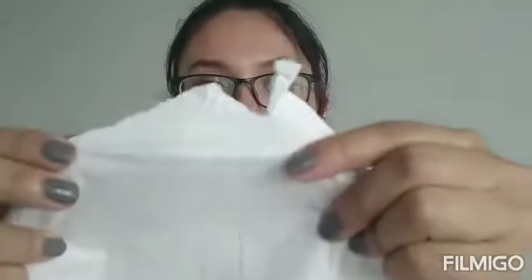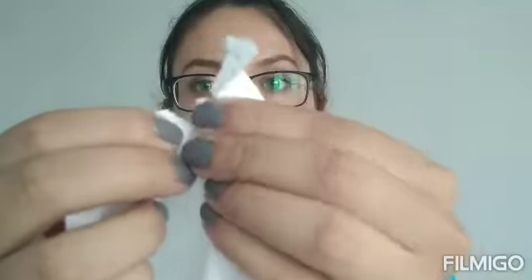Now I'm going to show you that the melt-blown cloth is very fragile and breaks easily. This one can break very easily, and when you hear the sound, it sounds kind of paper-like. This other one, whose quality is way better, we break it. The sound is not as much, and you can see that you need a little more strength to break it.